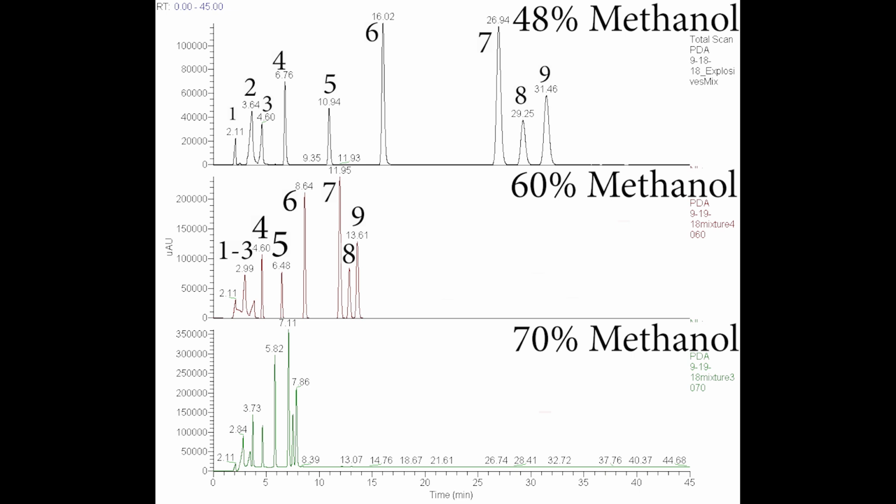We have this whole fancy pump system, so we don't actually have to keep the percent B the same the entire time we're running. Just like we can adjust the temperature of a GC run during analysis, we can adjust the percent B, the mobile phase composition, in the middle of a run for HPLC. That's one of the things that we program in, and this is called a gradient, running a gradient or gradient elution.